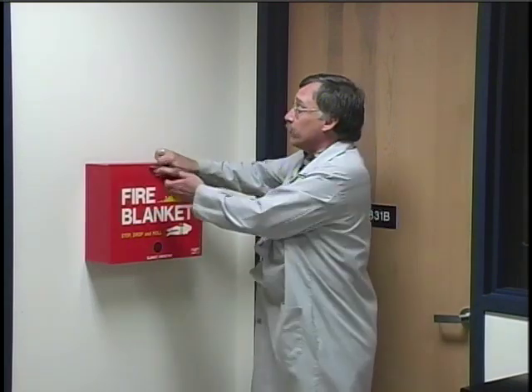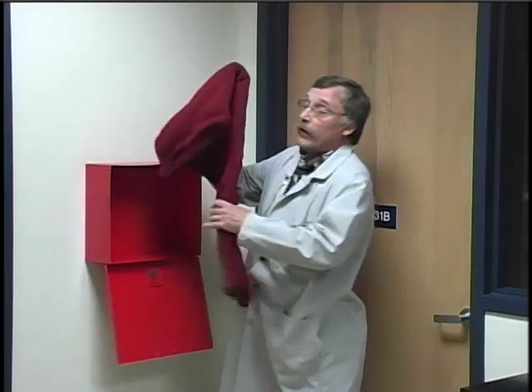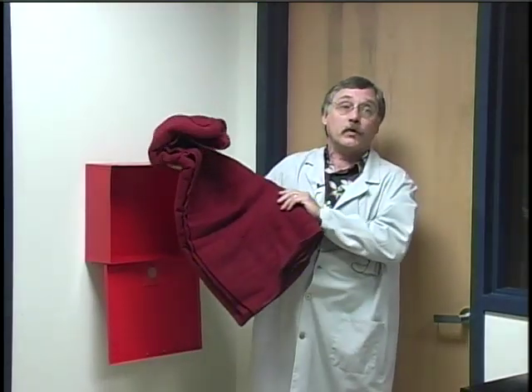Chemistry labs sometimes use Bunsen burners to heat chemicals, so there's always the chance that you could set yourself on fire. If that happened, you'd want to use the fire blanket. Notice where the fire blanket cabinet is in your room. To use the blanket, simply take it out of the cabinet and wrap it tightly around the person who is burning, and it will smother the flames.